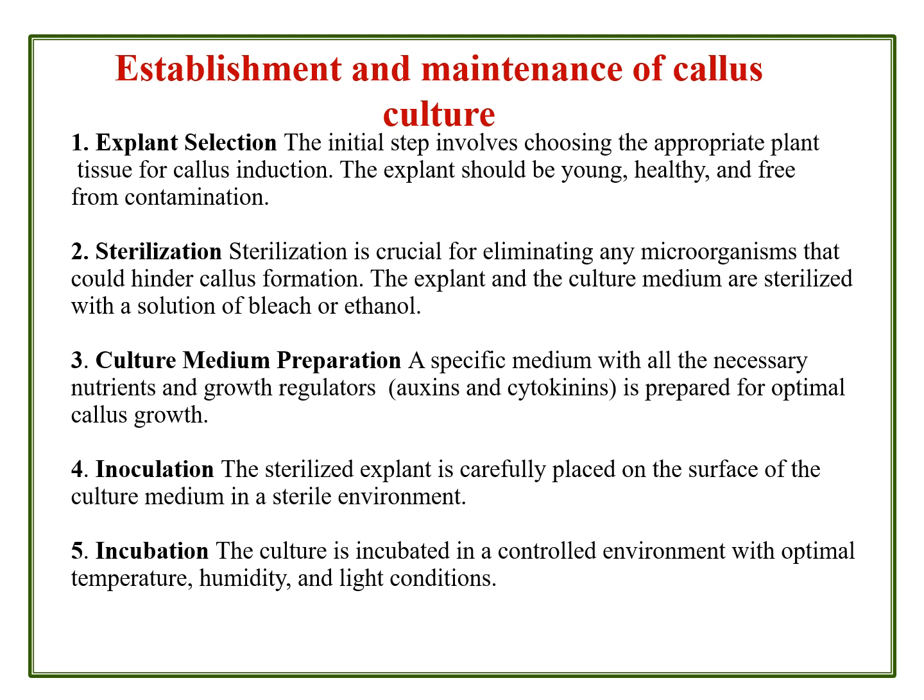Here the moist heat, the water vapor generates the pressure, so under 15 psi pressure for a holding period of 15 to 20 minutes, their cell walls will be completely disintegrated. So once the cell walls are completely disintegrated, there are no more microbial forms in the plant tissue culture medium that you prepared for the callus culture, and it is ready for inoculation.